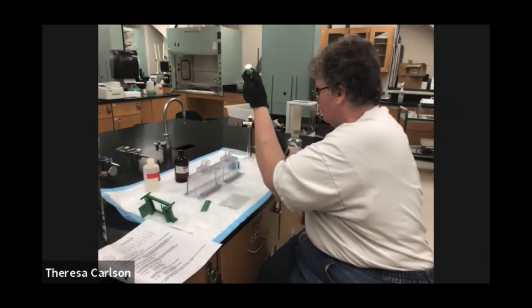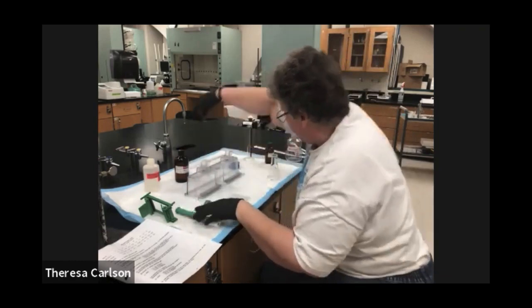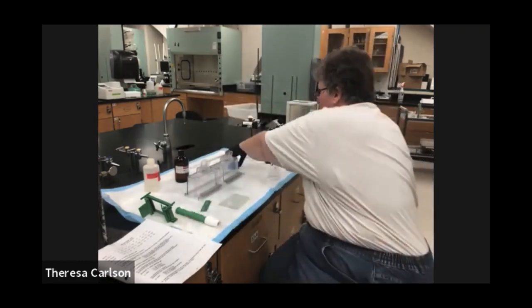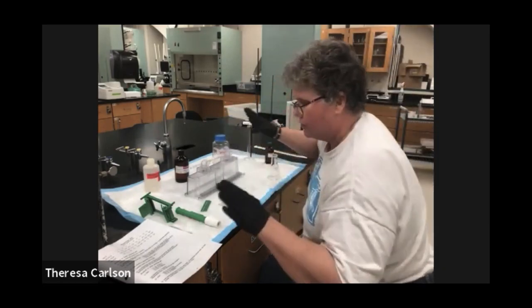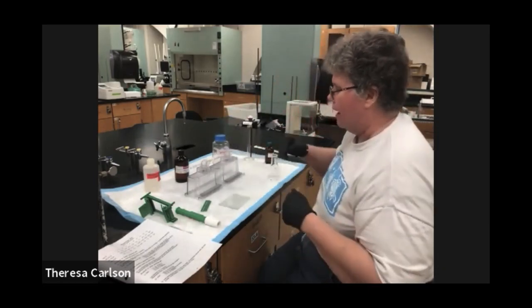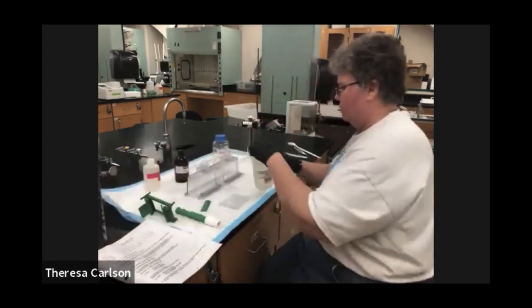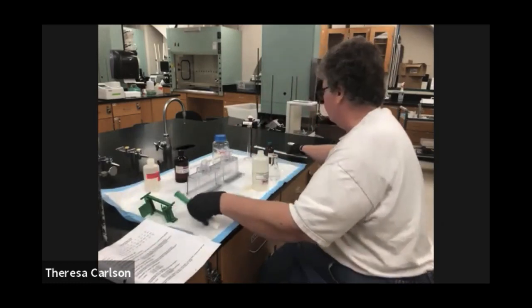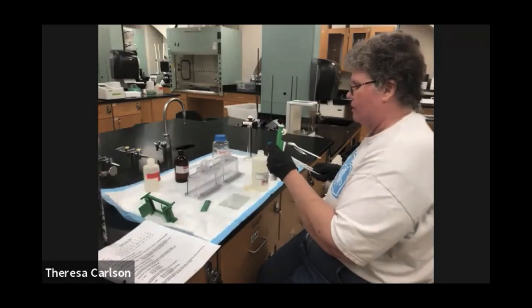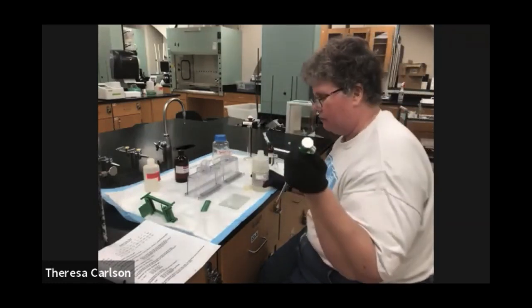Now remember, you are working with acrylamide, and acrylamide is a neurotoxin. Because acrylamide is a neurotoxin, anytime you touch anything related to acrylamide, you must have gloves on your hands. Acrylamide is absorbed through the skin, so we don't want any of you to suffer neurological damage from long-term exposure to acrylamide. So please make sure that you are wearing gloves whenever you touch anything related with acrylamide.